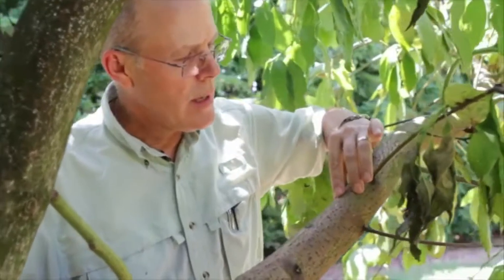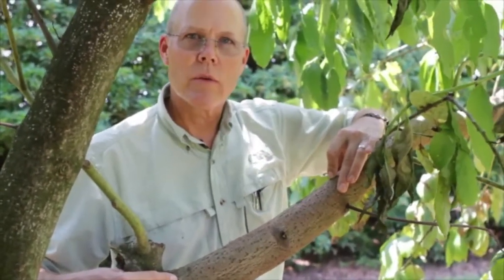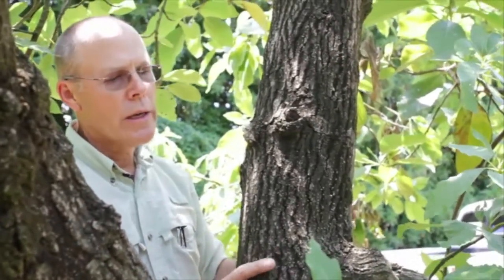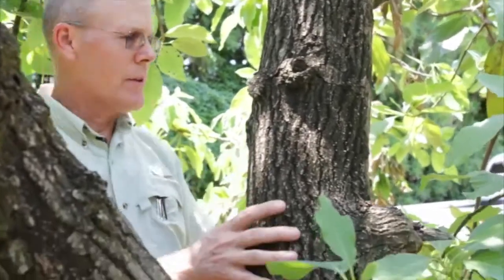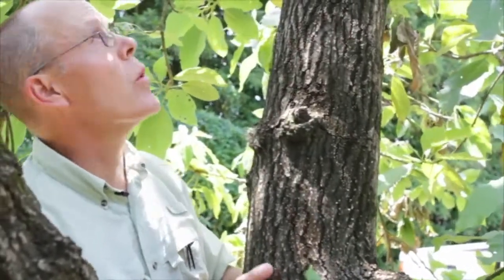Here I'm pointing to several areas where you can see there's a little bit of sawdust, providing evidence that there is some type of insect or beetle boring into this wood. This is a good area to sample the sapwood because there is evidence of the beetle. However, not every tree will show clear evidence of beetles, because weathering, rainfall, and other factors may knock off the sawdust evidence. So I usually inspect the limbs or trunks right underneath where the symptomatic leaves are above, and sample there because it is underneath symptomatic tissue.